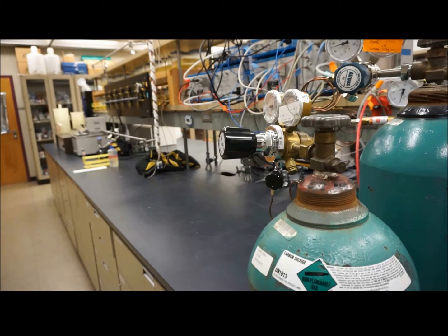We will repeat this transfer when we want to start an experiment, or after a few weeks in order to maintain viability of the culture. Today we inoculate only 1 tube of media, but normally we inoculate at least 2 tubes in order to increase the volume and protect against tubes that don't grow.